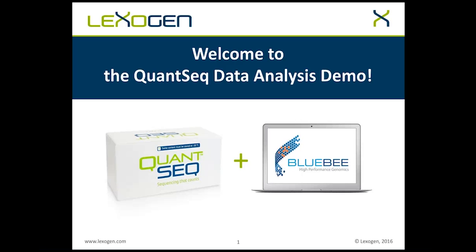Several technical specialists from Lexogen and Bluebee are present here today at this webinar, and they are happy to help you. I have seen in the registration form answers that there are some attendees who are still not using QuantSeq, and therefore, for the beginning, I would like to shortly introduce it.